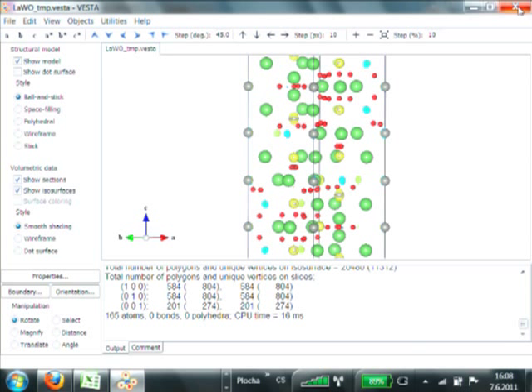Henrik from Stockholm University. I was thinking, in order to avoid excessive overlap, if you have a problem to get Superflip to converge, is it a good idea to use an excluded region at the higher 2 theta? To some extent, yes. If you have a total overlap, essentially a continuous band of peaks, then they don't really bear much information for the ab initio phasing, so you can throw them away. It does not really harm too much if you don't throw them away, but it's good practice to remove this if you have really strong overlap. That's true.